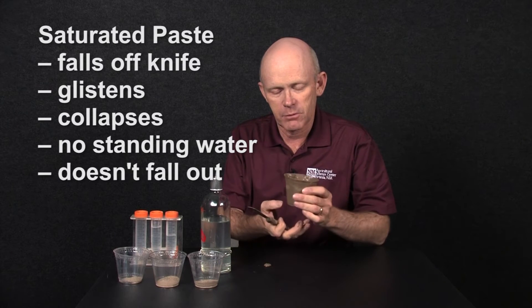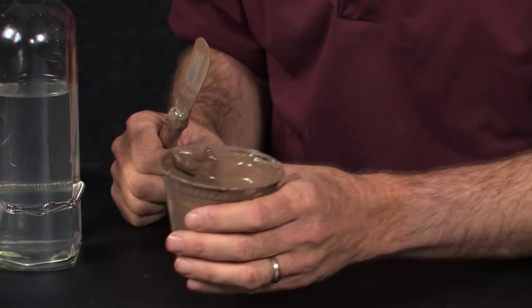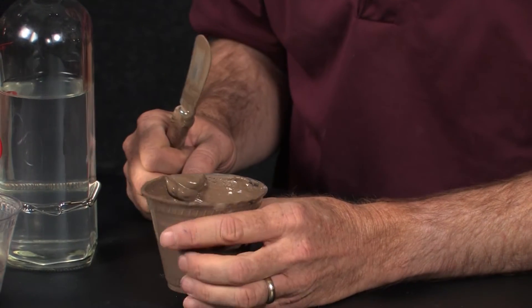Then they would take it, put it on suction, the liquid will come off, and we'll run that through a salinity meter and we'll be able to tell what the salinity of the soil is.